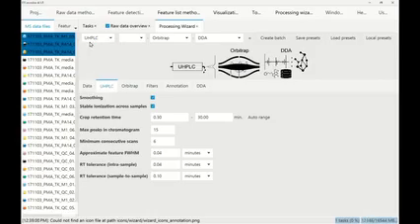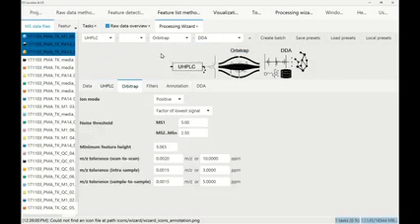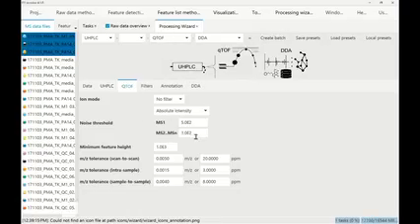So you're just changing to UHPLC on top, Orbitrap, and DDA. If you change it to Orbitrap, you're going to see the Orbitrap settings, which are a little bit different to a QTOF. Now you might say, but wait, there are so many different QTOFs. How can you have one setting that fits them all? We don't, right? The really important thing is that you have to optimize your data processing workflow for your instrument, but also your method, because the noise levels very much depend on your measuring parameters.